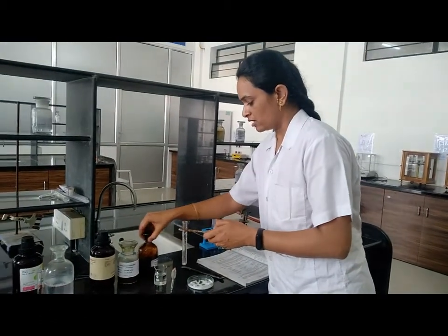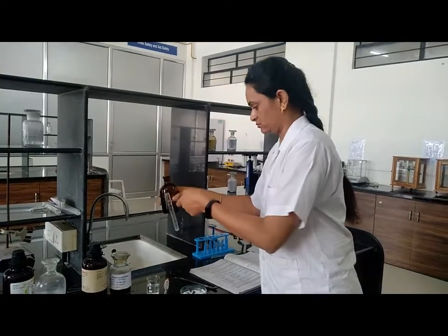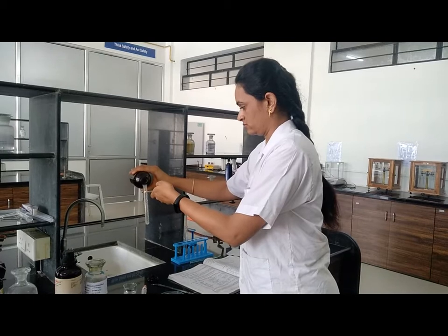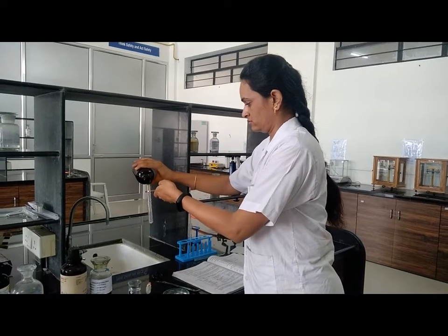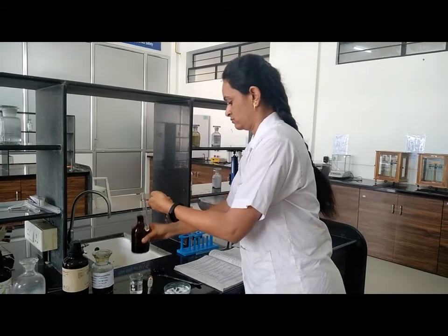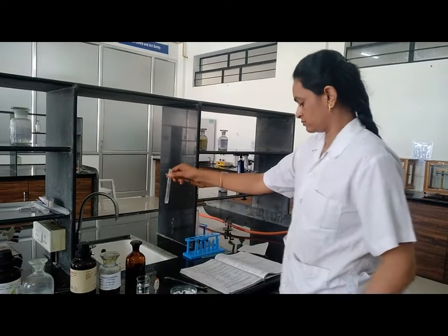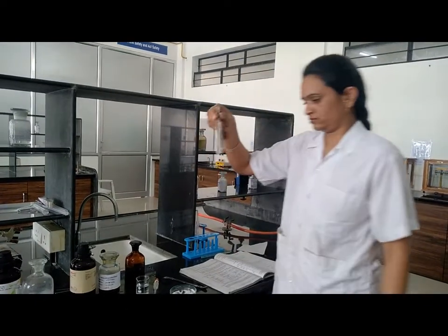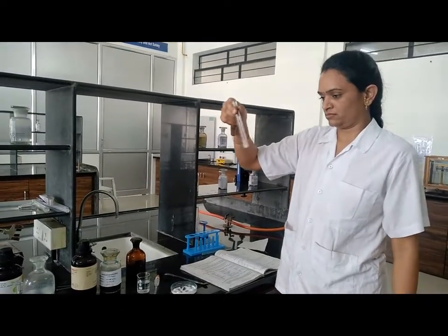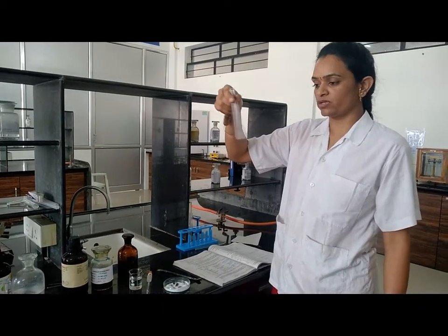Then add ethanol. Aspirin is soluble in ethanol, freely soluble in ethanol.